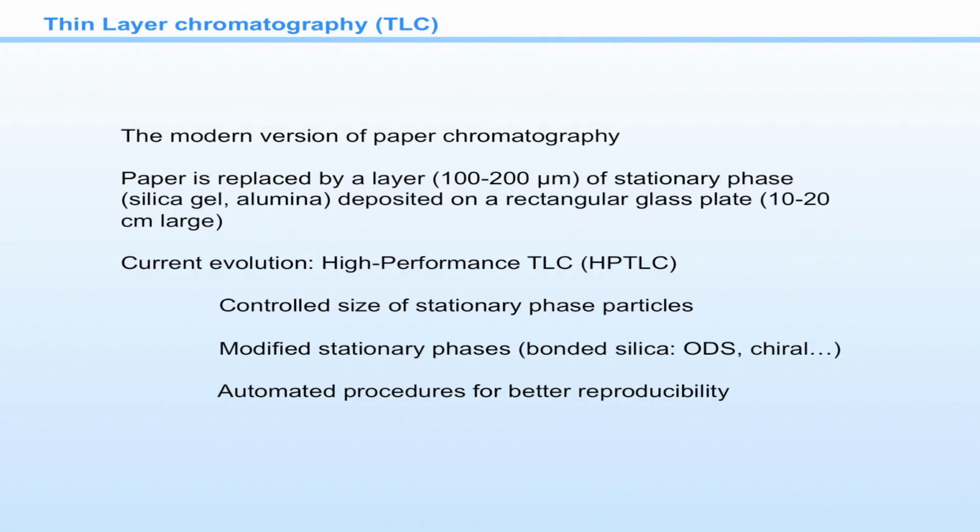So this is the first chromatographic technique. The second chromatographic technique is thin layer chromatography. In paper chromatography, the separation of the components is based upon partition. But in thin layer chromatography, the separation is based upon adsorption. Why is it so? Because here the stationary phase is silica gel, which acts as the stationary phase and is an adsorbent. And the mobile phase, as usual, is your solvent, that is the organic solvent. Now, this is the introduction part.